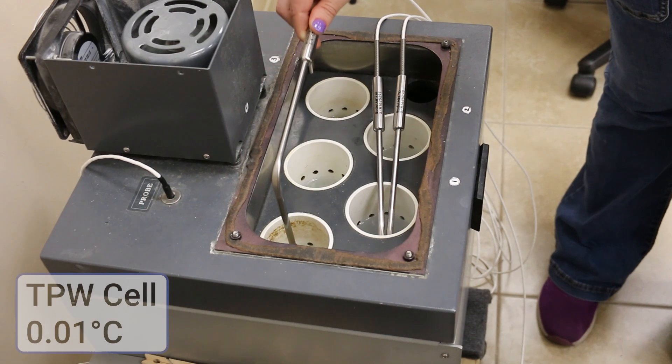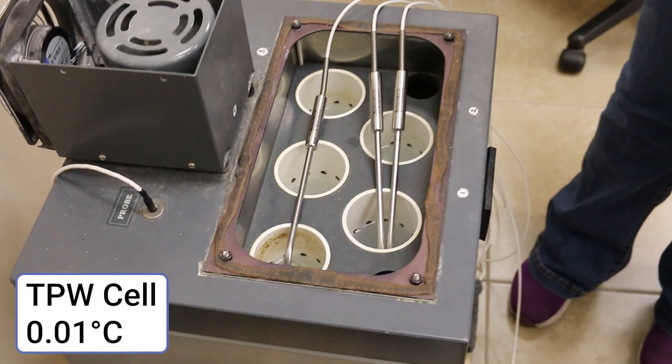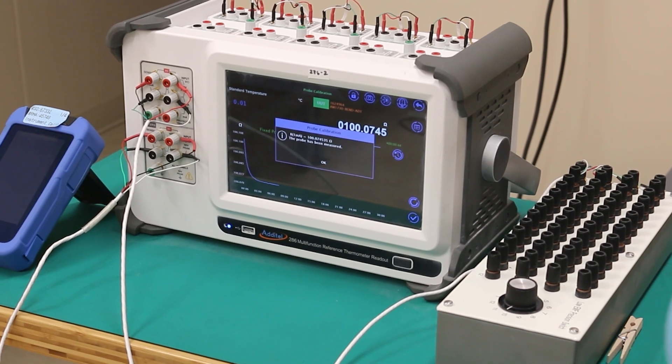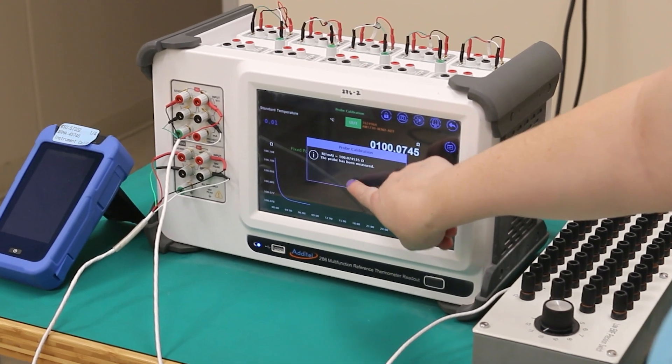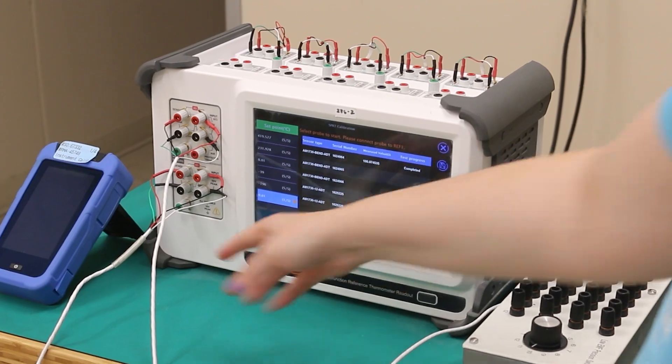Lastly, we will do one more triple point of water measurement with the exact same procedure as previously shown in this video. In the final calculation, both triple point of water values on each probe will be averaged to ensure the probes are functioning normally across both ITS-90 sub ranges.